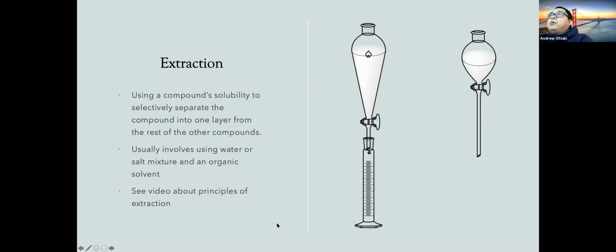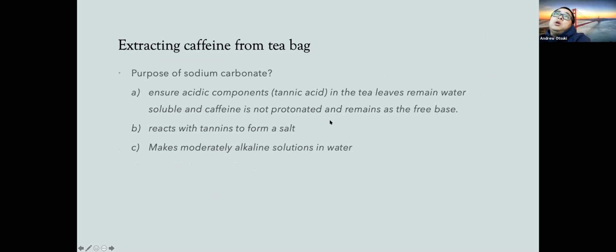So we're going to use an organic solvent to do that. Watch the video about the principles of extraction for review, so you understand how we use this on a daily basis to extract things during or after chemical reactions. So this is a review of extraction here.